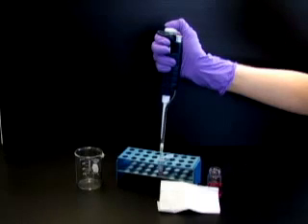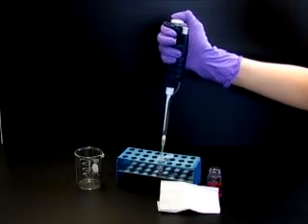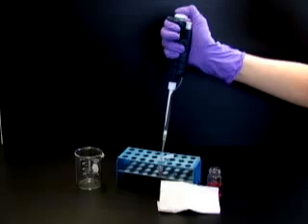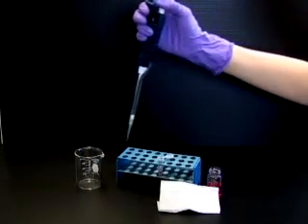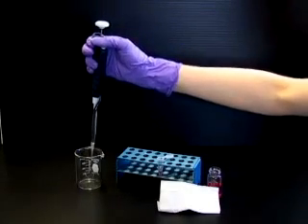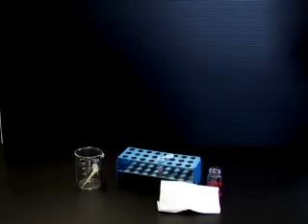With the plunger fully depressed, carefully remove the tip from the container by sliding it up the container wall. The importance of sliding the tip along the wall increases as the volumes become smaller. Finally, allow the plunger to return to the up position. If you are done working with a particular sample, press the tip ejector button to release the tip into the proper waste receptacle.